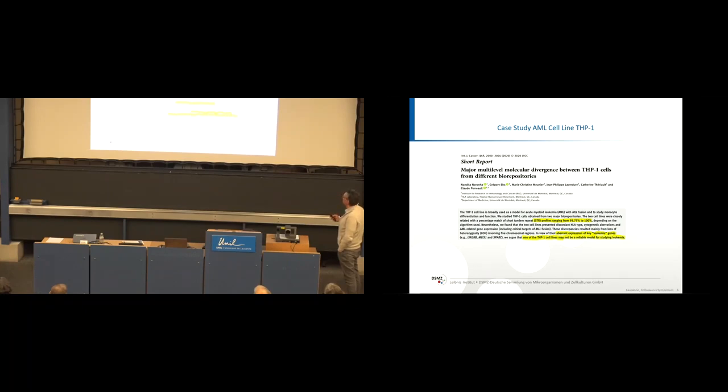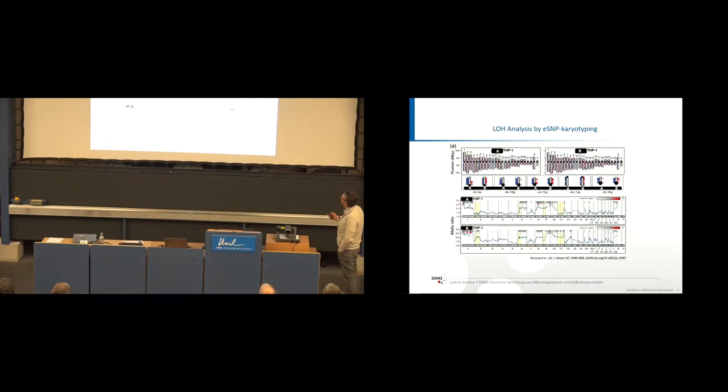Nandita obtained THP1 from two major bio-repositories. The STR profiles were really very close together. But finally, they found out that the discrepancies they worked out mainly were due to loss of heterozygosity. Finally, they argued that one of the THP1 cell lines is not anymore a reliable model for studying leukemia, although authentication has taken place. This is a real problem. Now I will try to convince you what they have done.